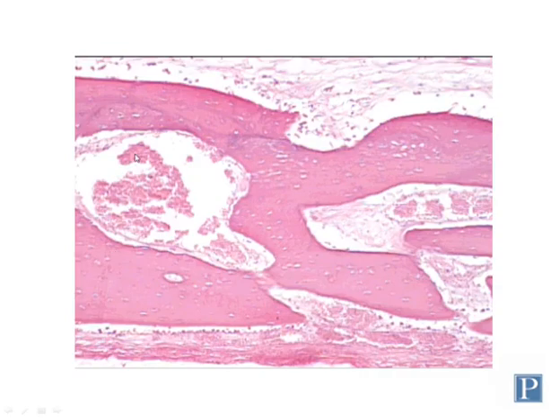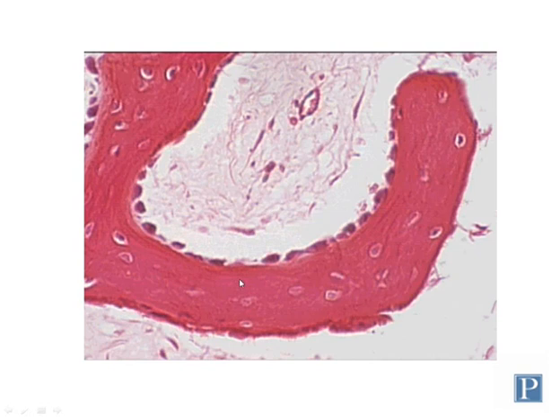So here's a higher magnification view of this developing trabecular bone. Again, this type of bone gets its name because of the name of the structures, trabeculae, which are these elongated finger-like structures. And you can see that these trabeculae are riddled with lacunae, and inside these lacunae are osteocytes, just like in compact bone. Here's a high magnification view, and here's a kind of hook-shaped trabecula right here, and you can see there are lots of lacunae with osteocytes inside them.